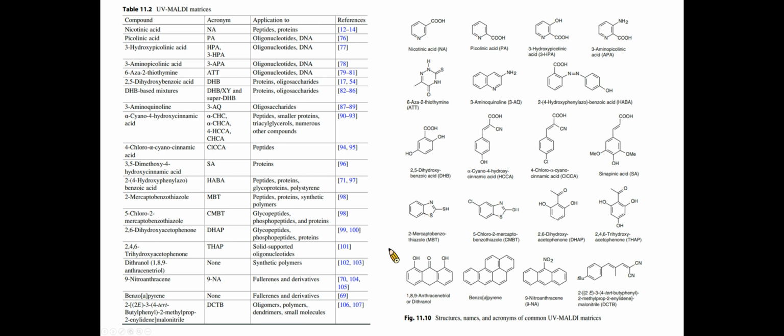The choice of matrix depends primarily on the wavelength of the laser used, followed by the nature of the object being analyzed. Commonly used matrices are nicotinic acid, 2,5-dihydroxybenzoic acid, and sinapinic acid. Most MALDI uses solid or crystalline organic matrices, but these matrices produce corresponding background peaks in the low mass region, which interfere with the characterization of small molecule compounds.